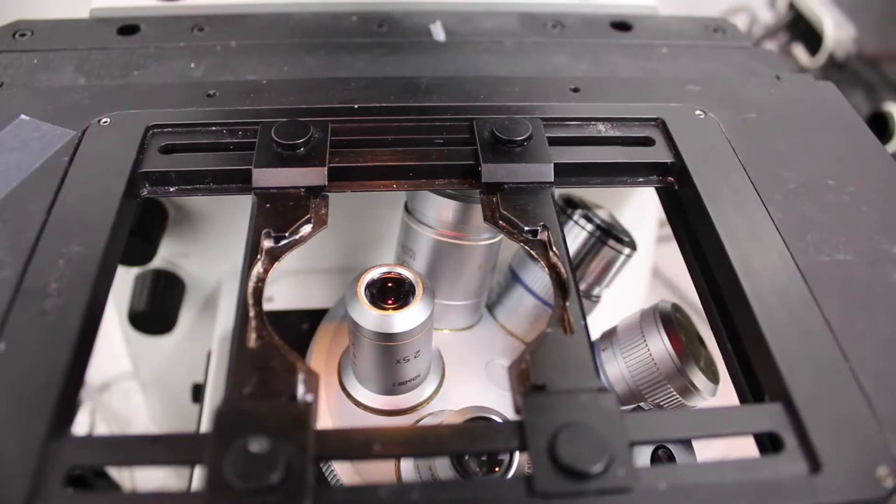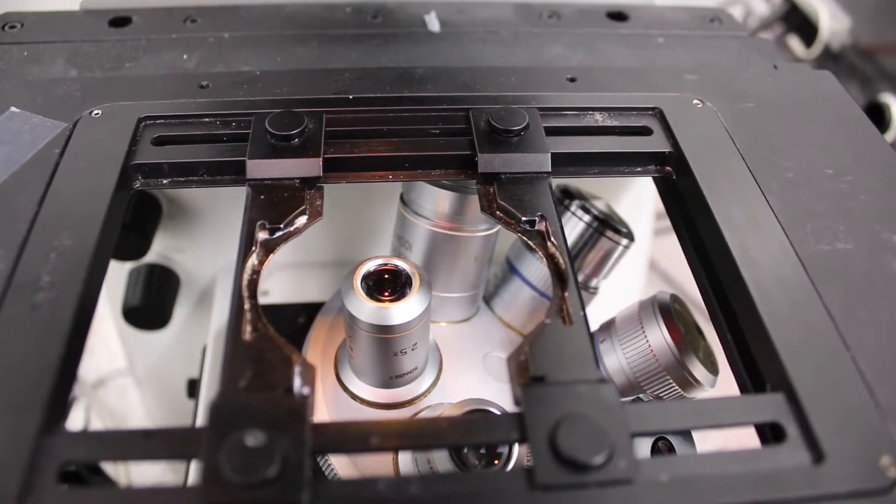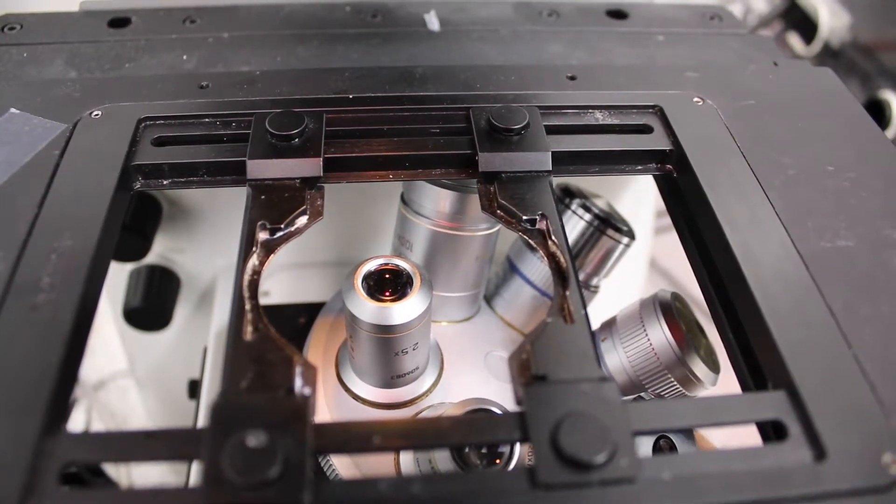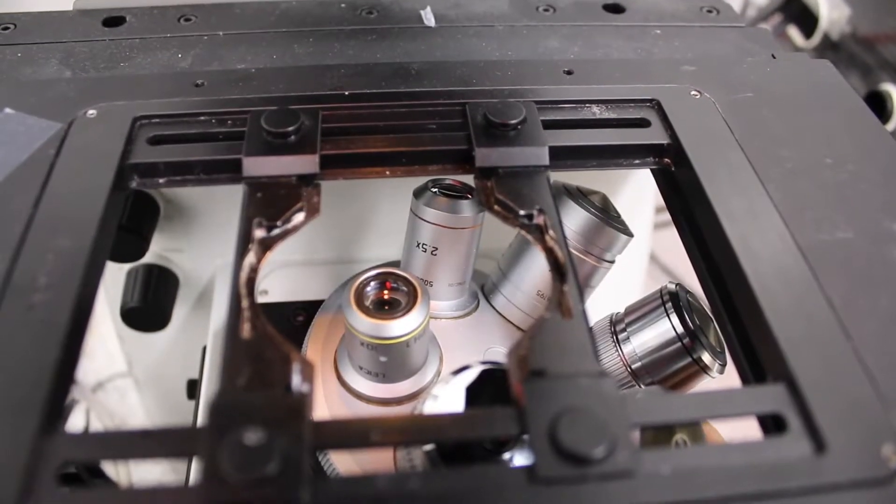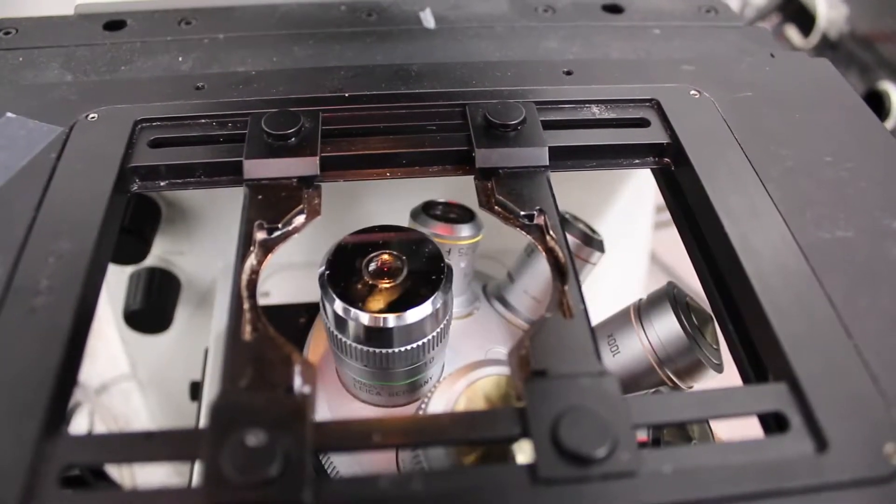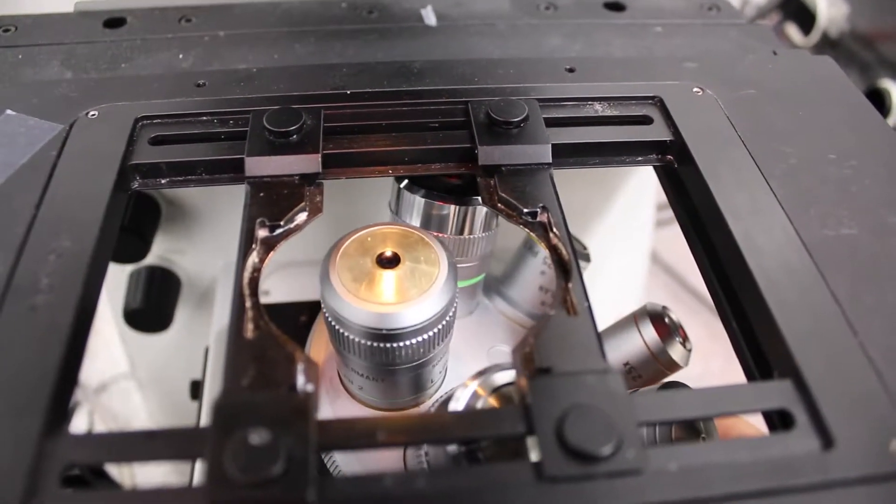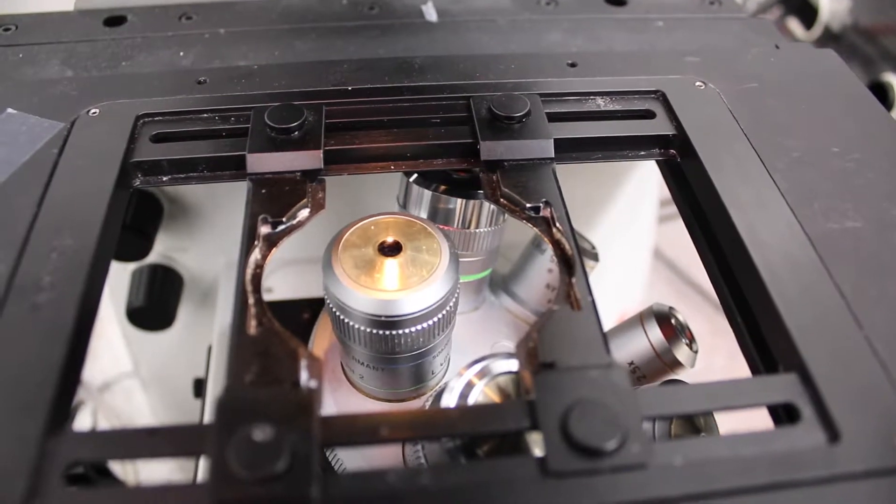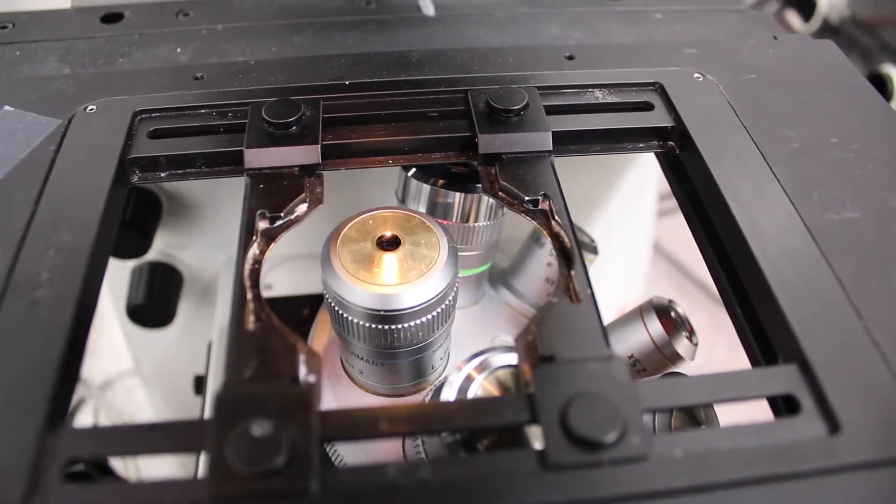Then you have to choose which objective you want to use. So there are six objectives on this objective wheel. Here is the 2.5x, this is the 10x, they're all in order. This is the 20x, this is the 40x.